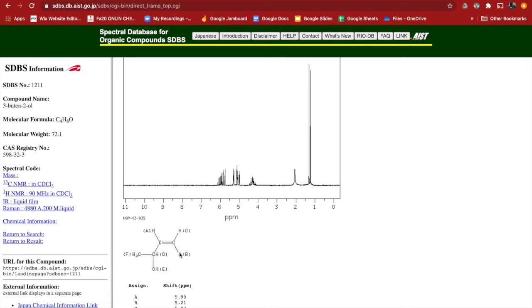So it's got 1, 2 bonds away from this neighbor, that's a neighbor. 1, 2, 3 bonds away, that's a neighbor. 1, 2, 3, 4 bonds, is that a neighbor through 4 bonds? It's through a very short double bond, so yes. So this one has 1, 2, 3 different neighbors. So 3 different neighbors, it'll be a quartet. Like, I don't know if it'll be a quartet. These neighbors are not equivalent. So yeah, it's probably not, and it isn't.